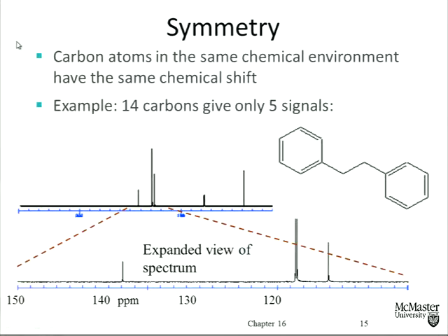Those are sp2 hybridized carbons, right? So they should be north of 100 ppm. Here's the region, north of 100 ppm. 1, 2, 3, 4 resonances, right? There's a CH2 resonance, and that's way down here at about 30 parts per million. There's one other signal there, and that's the CH2 group, sp3 hybridized carbon, south of 100 ppm. Only one signal because the two CH2s are equivalent.